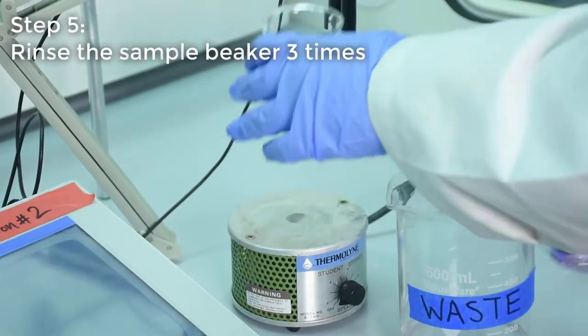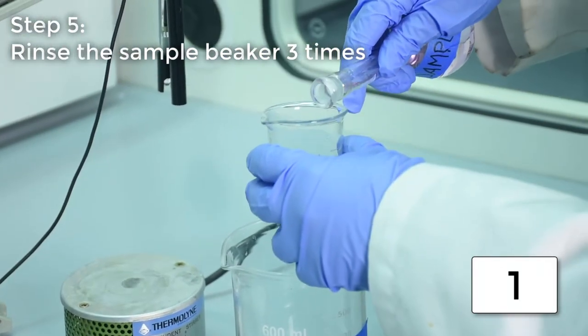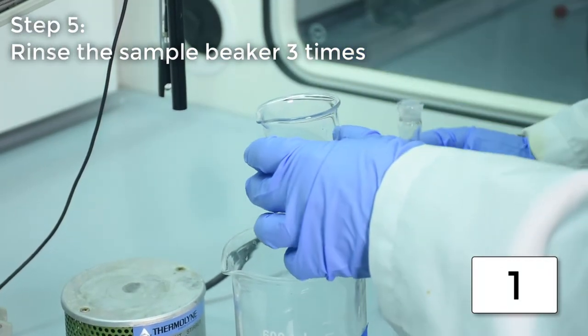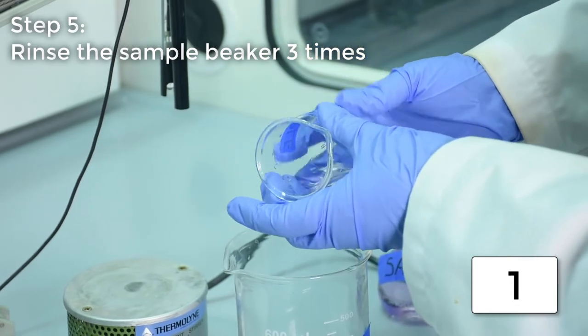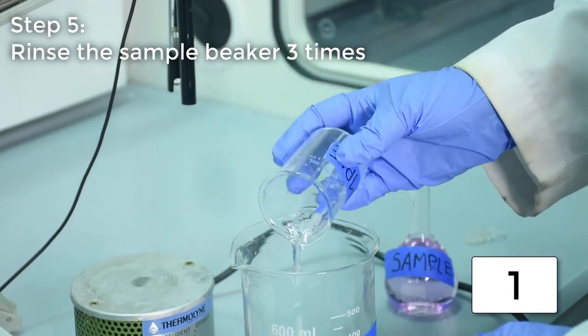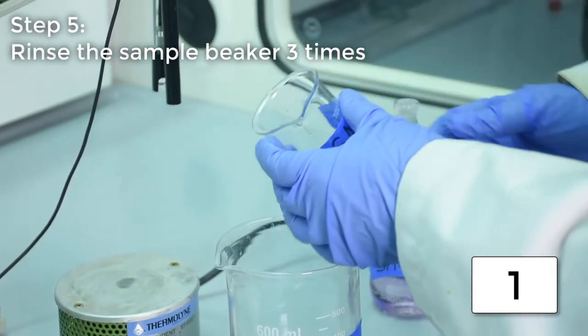Before measuring a standard or sample, rinse the beaker three times with a small amount of the solution being measured. Tilt the beaker to ensure the whole inner surface has been rinsed and pour out the rinses into a waste beaker.